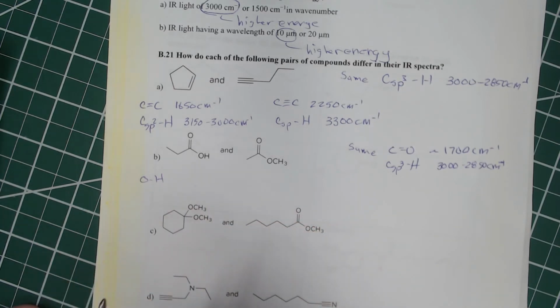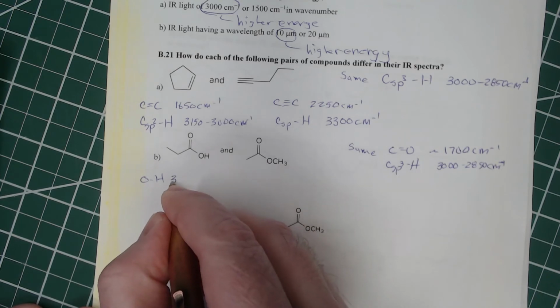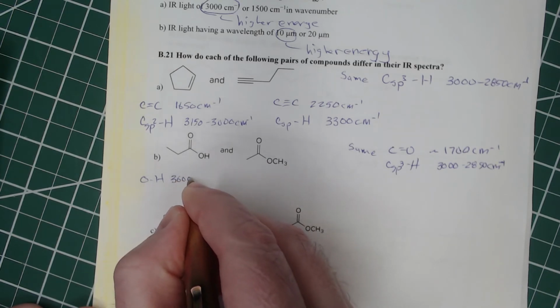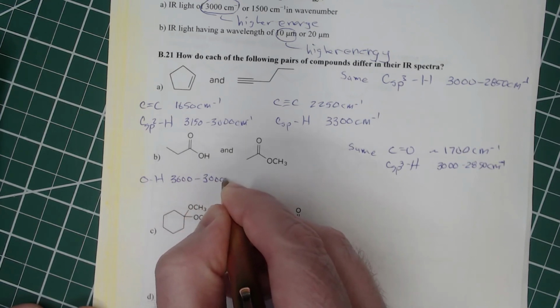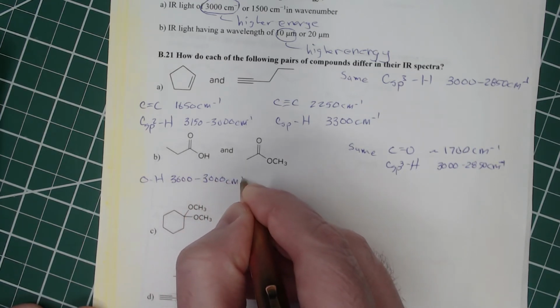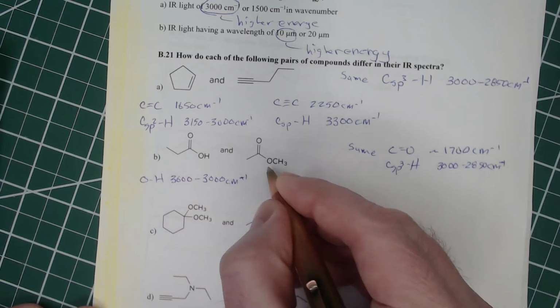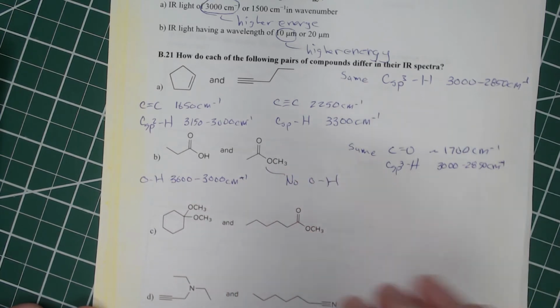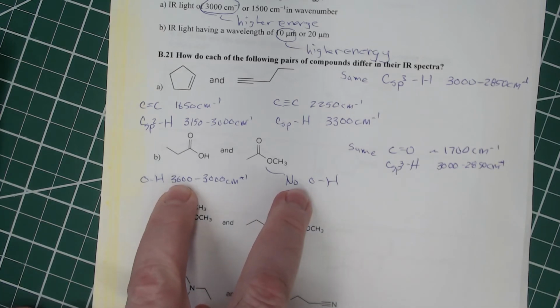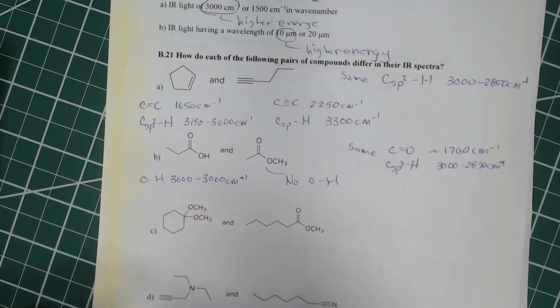I'm going to show you an example of that one a little bit later, but it's from about 3,600 all the way down to about 3,000 reciprocal centimeters. And this has no OH. So we should be able to tell these apart very easily. And that's going to be the biggest difference between these in the functional group region.